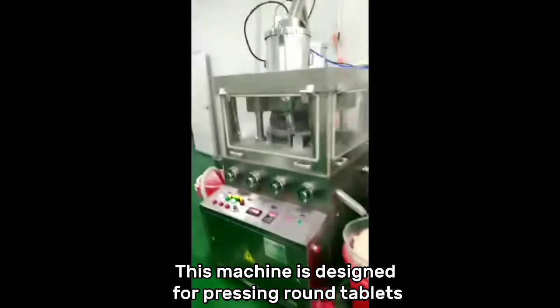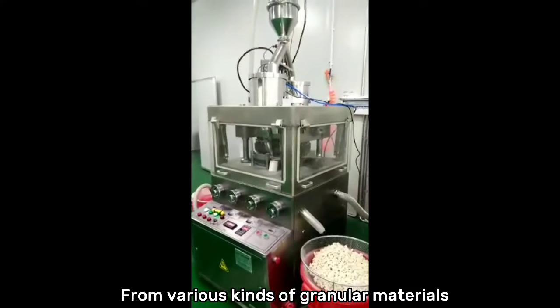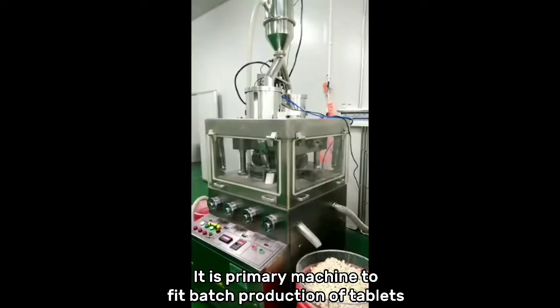This machine is designed for pressing round tablets from various kinds of granular materials. It is the primary machine to fit batch production of tablets.